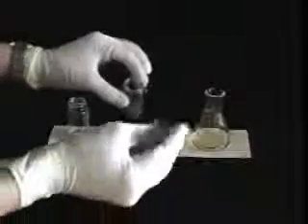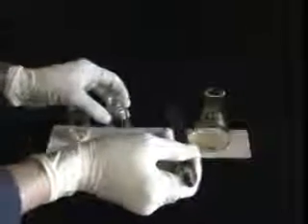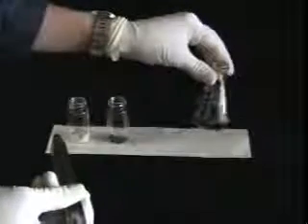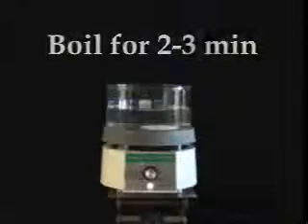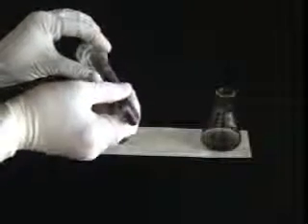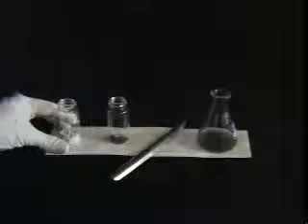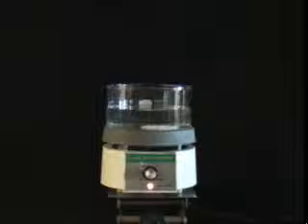Add a small amount of charcoal to absorb the impurity. Do not add too much, or the charcoal will also absorb your compound. Swirl the flask and boil it in the water bath for 2 to 3 minutes. Charcoal is very fine and can be hard to remove by filtration. It is easiest to add a small amount of a filtering agent, such as Celite, to absorb the charcoal and facilitate the filtration. Add only a small amount, swirl the flask, and heat it once again for 2 to 3 minutes before performing a hot filtration.